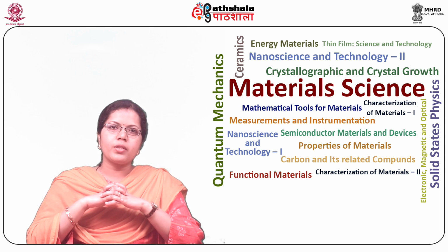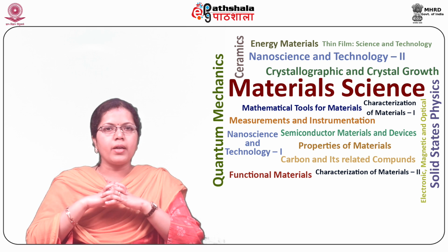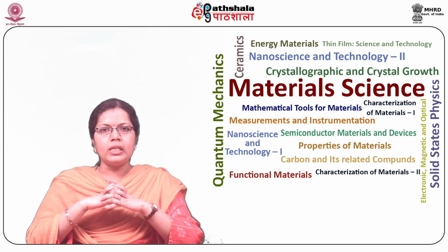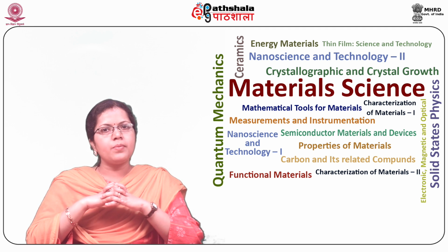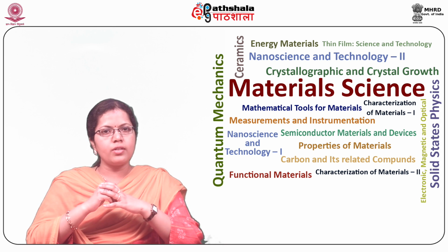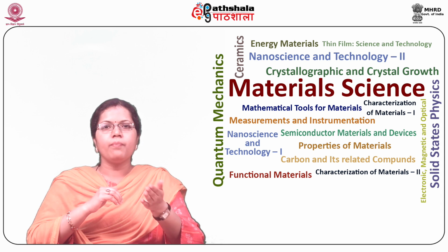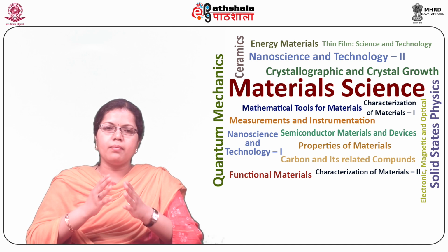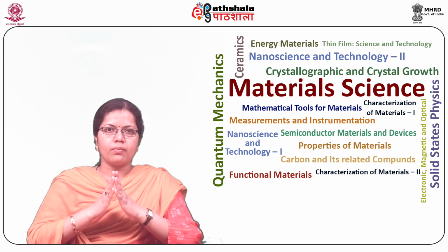Optical microscopes are also called light microscopes and employ visible light and magnifying lenses to see tiny things. The optical microscope has been one of the most important tools in many scientific fields as well as industry, for example, biotechnology, the pharmaceutical industry, cell or microbiology, nanoscience, and microelectronics.